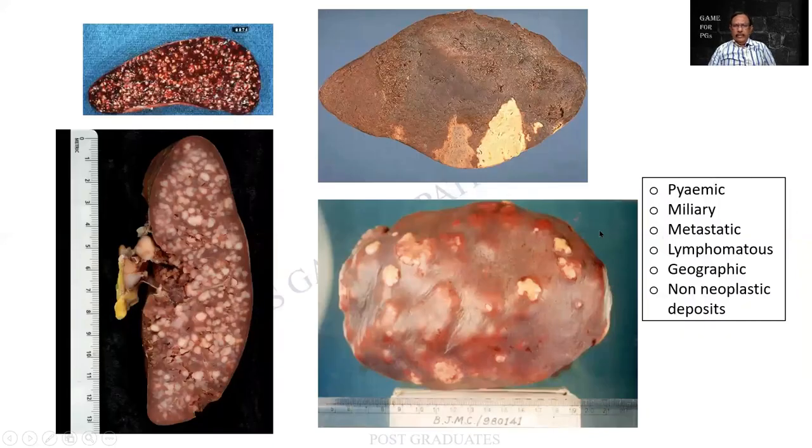An infarct. So clear. An infarct can be an area of localized necrosis caused by the sudden, complete and irreversible occlusion to the vascular flow. And this is what I had mentioned earlier. Whenever we see multiple nodules, this is fairly regular, so it need not be an infarct. But if it is going to be irregular like this, I will have to think of multiple abscesses or infarcts. Multiple infarcts can be happening in conditions such as a sickle cell anemia, where there can be repeated obstruction.